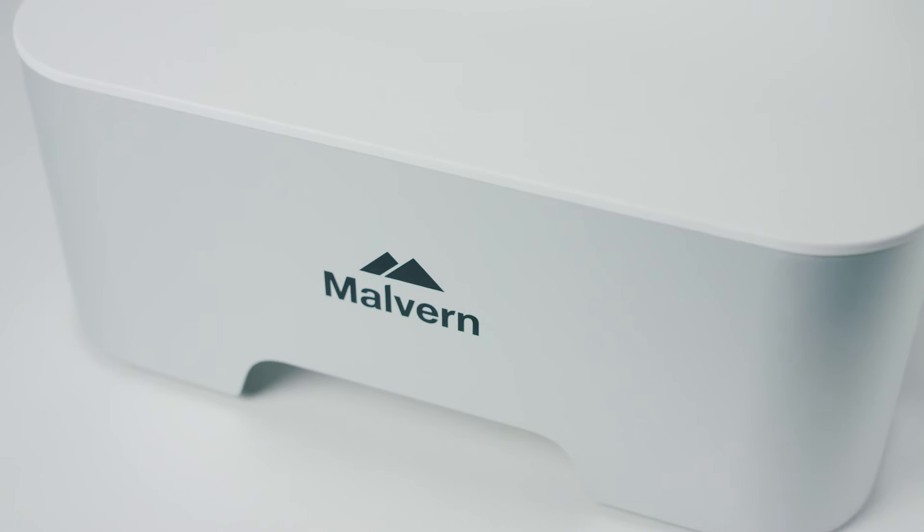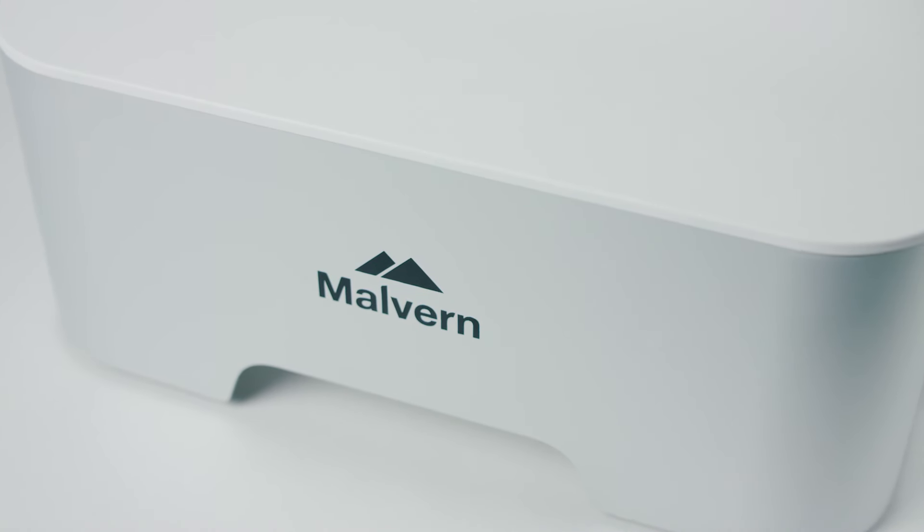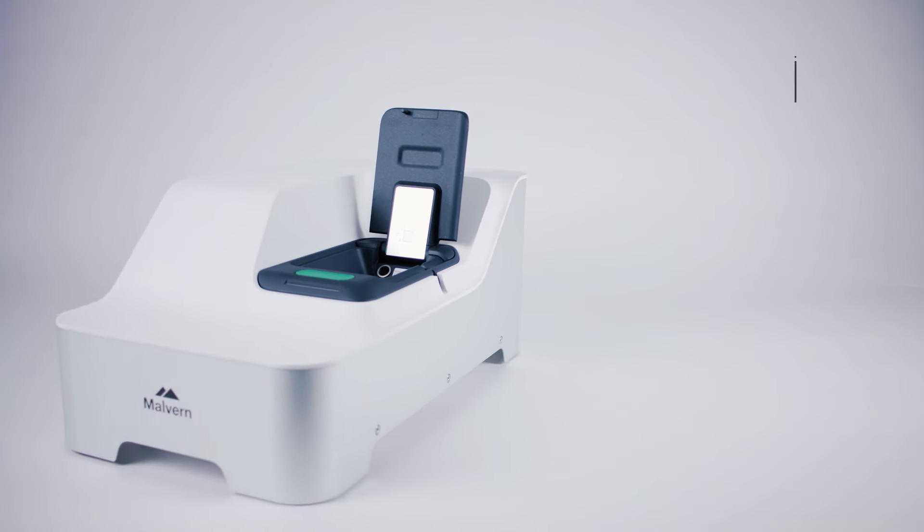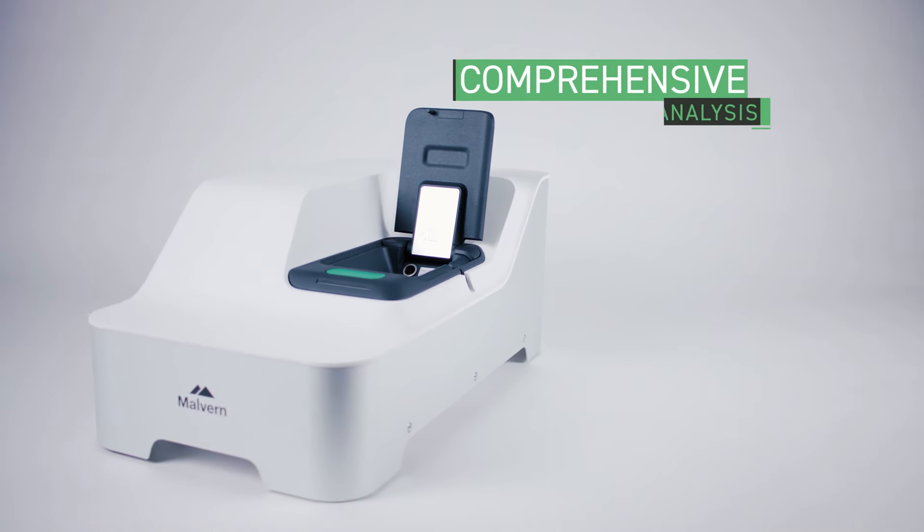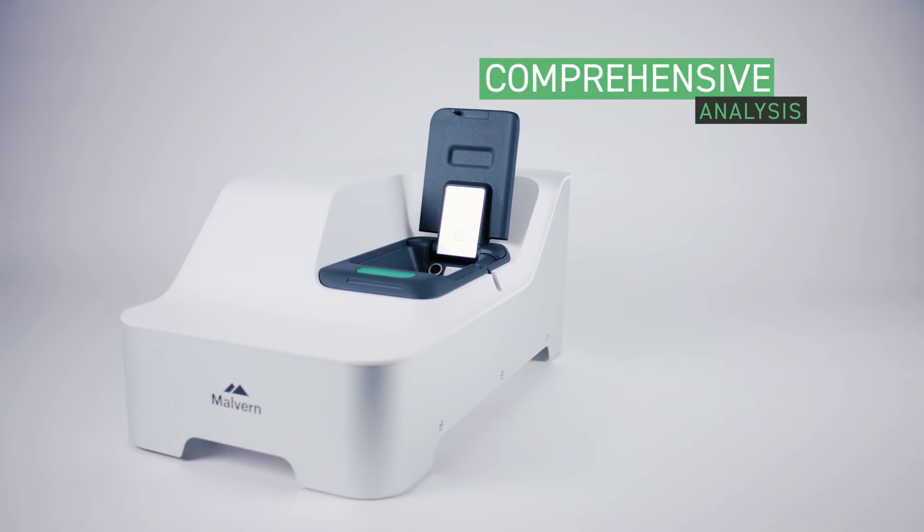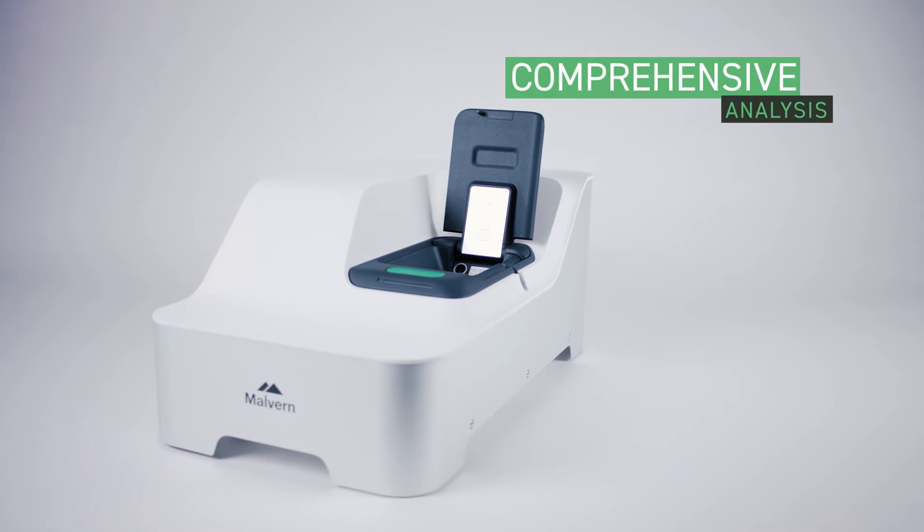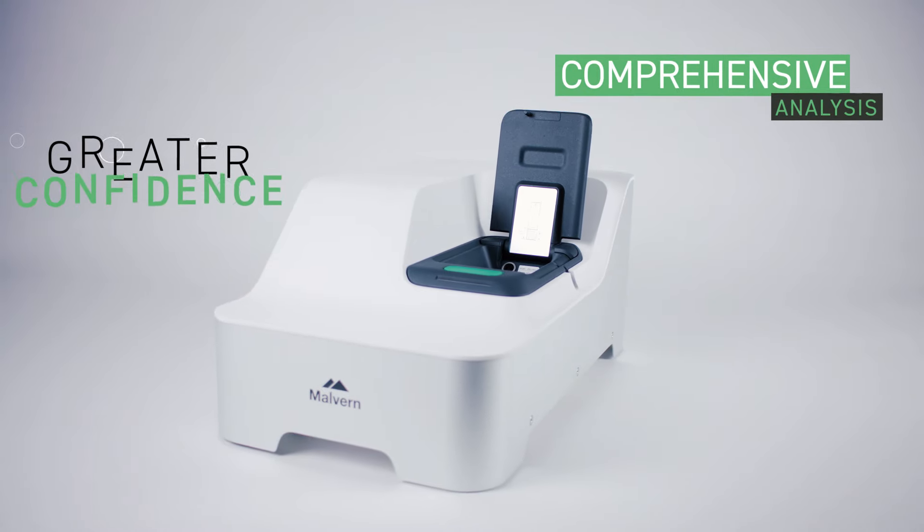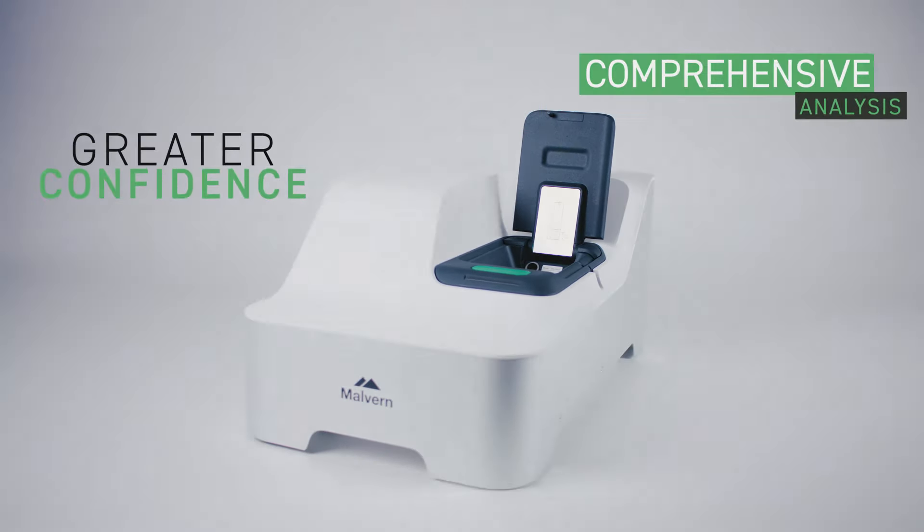By combining novel measurement capabilities with advanced data analysis, the system provides a comprehensive analysis of your materials, giving you greater confidence to make your next move.